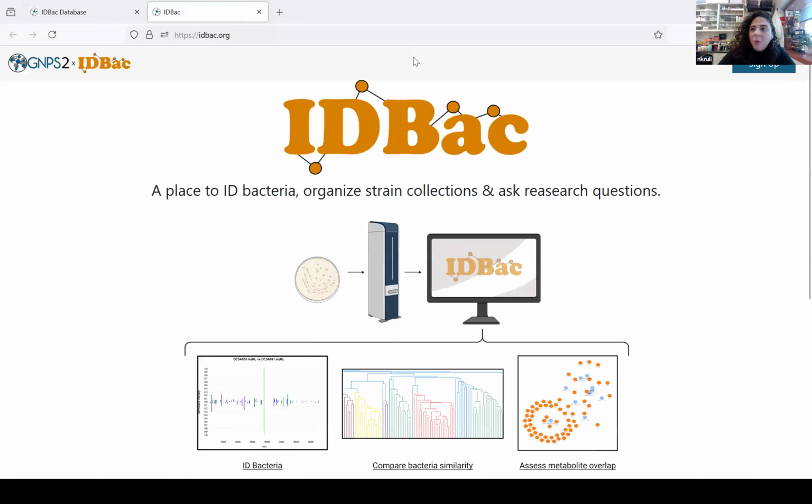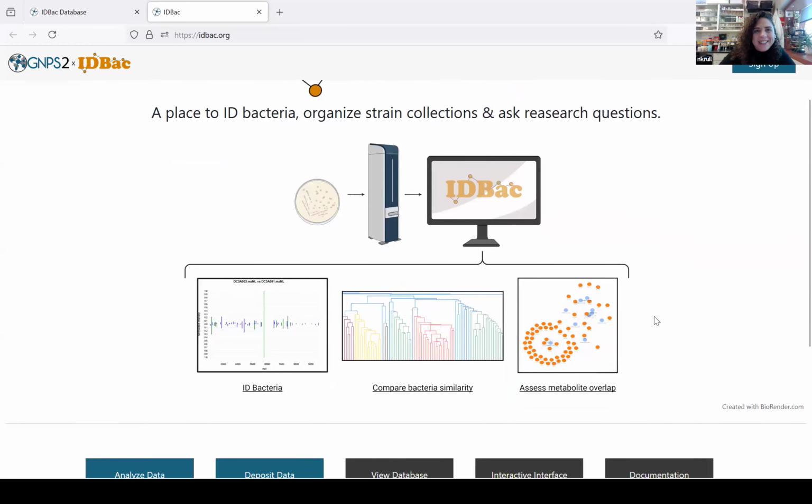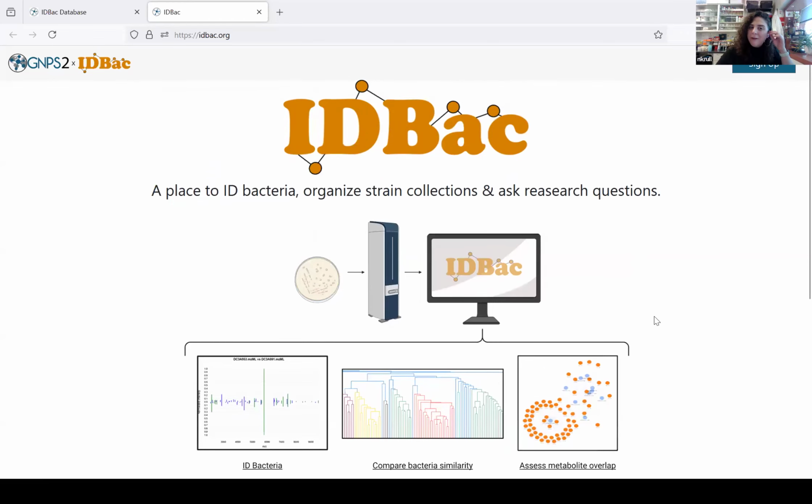And from here, we are now going to take the live tour. Again, go back to the database, but we're going to look at this landing page and then the analysis platform. So if you want to follow along with me, you're more than welcome. You can go to idbac.org, or you can save this link for later and explore it on your own time.